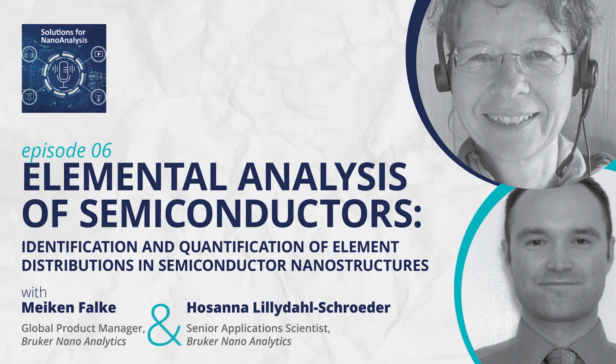So in addition to reducing time to data by improving solid angle and really integrating that with microscopy vendors, what else do you see as being the future of the EDS technique?